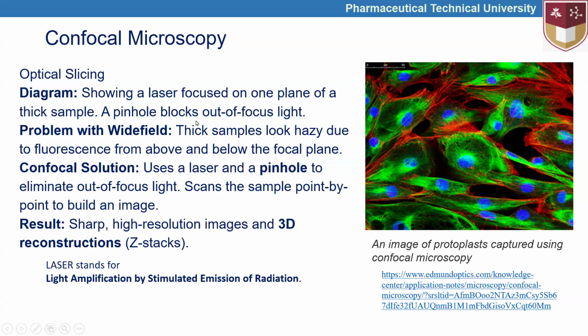A pinhole blocks out-of-focus light, and confocal microscopy uses a laser and a pinhole to eliminate out-of-focus light and scans the samples point by point to build an image, so that it develops high resolution 3D images.